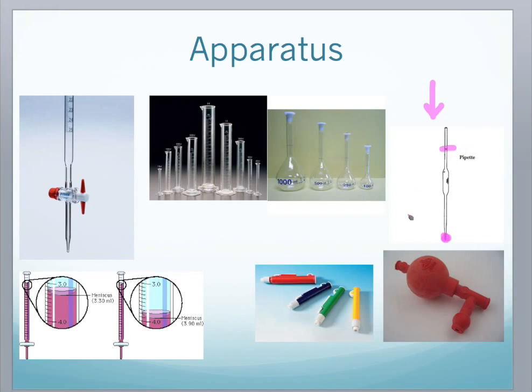Usually it's made out of glass, and you also will have one of these, which is known as a pipette filler. You can either have this squidgy ball here, or this plastic one here to fill it up. I've used them before, but I think it'll be worth watching a video on YouTube to see how to use these. I find these ones much easier to use, but these are equally as good. You have to try them both out and see which one works better for you.